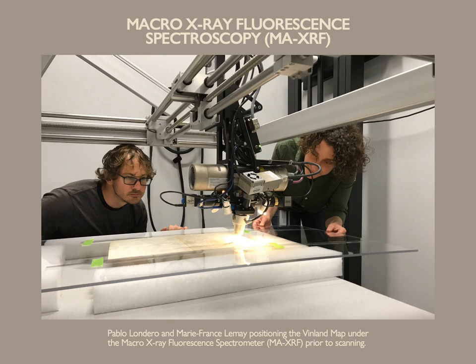X-ray fluorescence spectroscopy, or XRF, is a technique that identifies many of the elements present in an object. The capability to make measurements at a single point has been available for decades, but it is only relatively recently that macro XRF allows large, flat objects to be conveniently scanned. The two-dimensional elemental maps that are generated allow one to visualize the distribution of elements in an area of interest. This approach does not require a sample to be taken and is therefore considered a highly useful non-destructive technique.